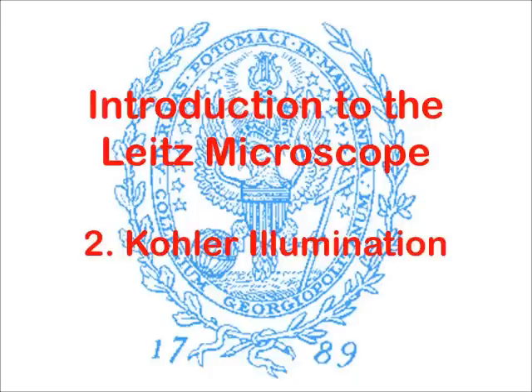While the human eye can adjust to many different situations, the camera is totally unforgiving. If you plan to do photography, then you must go through Kohler illumination every time you change objective lenses. If you change from 10x to the 40x objective lens, then you will have to do the adjustments all over again. I am requesting that you go through the following 10 steps for Kohler illumination so that you will understand how to correctly adjust the microscope.